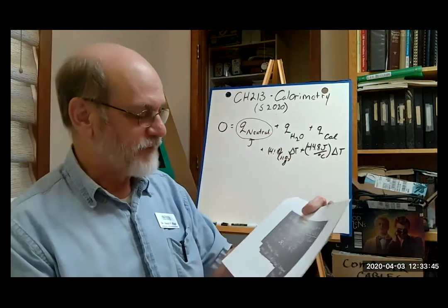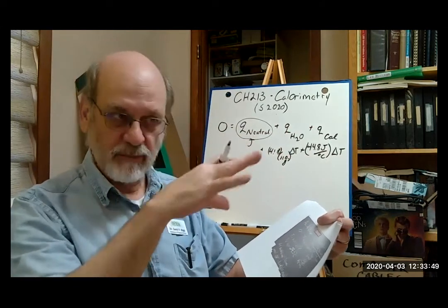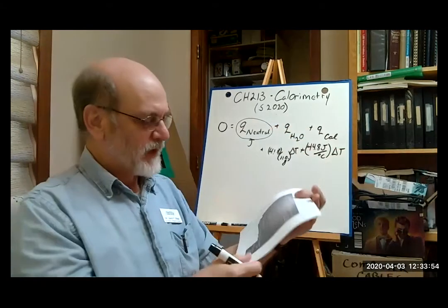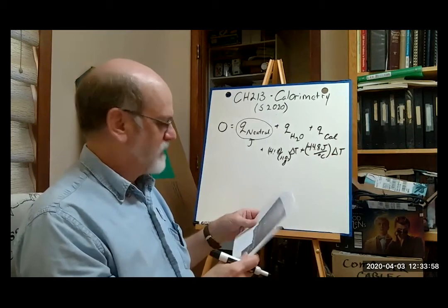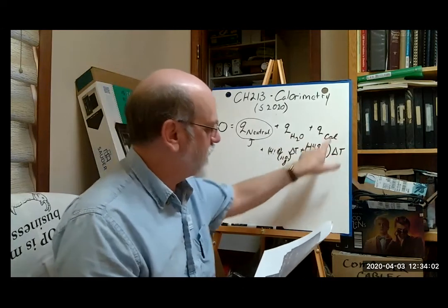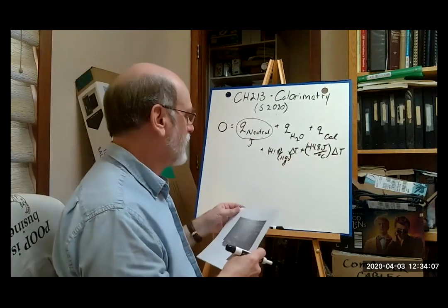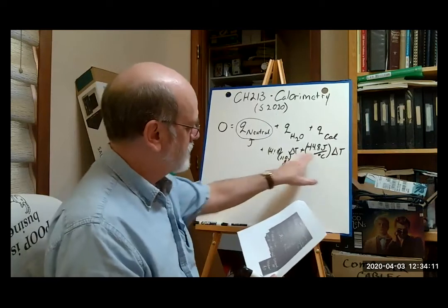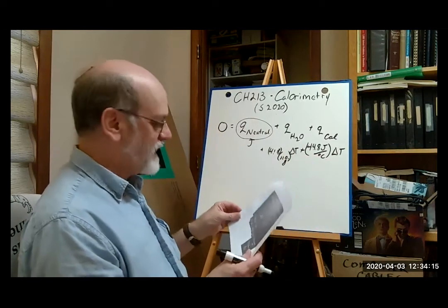The final temperature of the water we measure after the reaction has stabilized, completed, is 27.5 degrees. So that will be the same temperature change here for that one and for that one. So once you've determined the difference in temperature, you just solve for the heat.